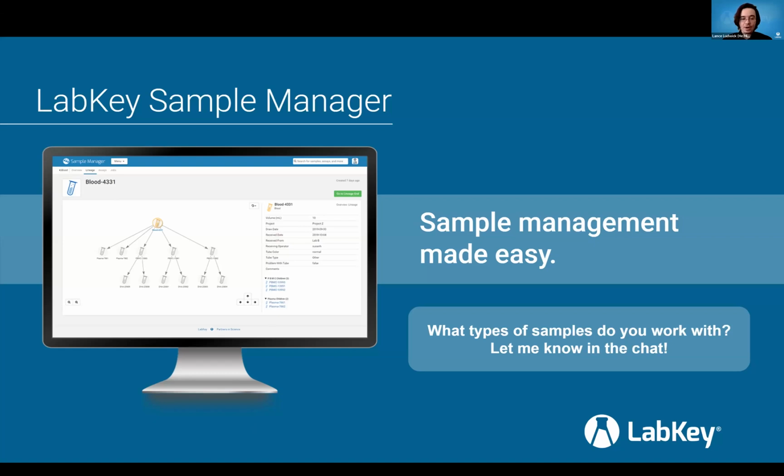My name is Lance. I'm a product specialist here at LabKey. I help different labs and different organizations evaluate Sample Manager to see if it's the right fit for them. And then once we do that evaluation process, I also help get labs fully onboarded and implemented so we can make sure that everyone's successful using the software.